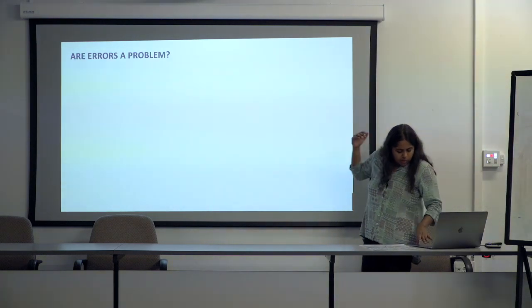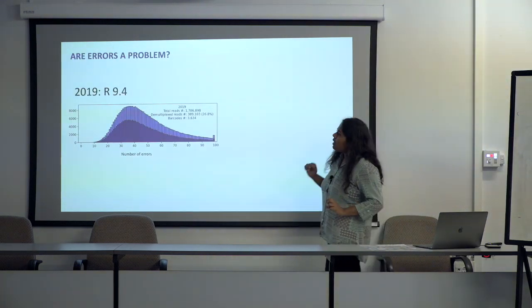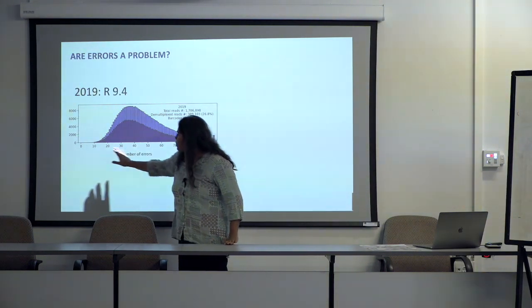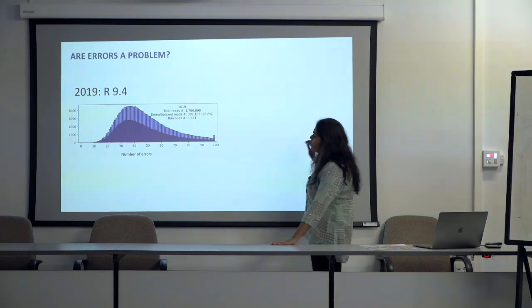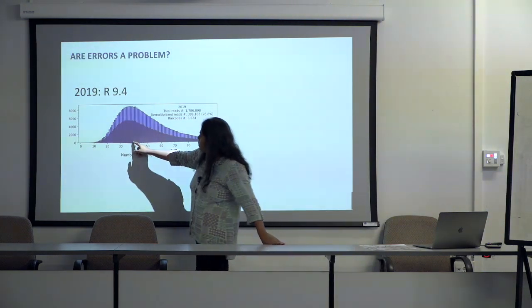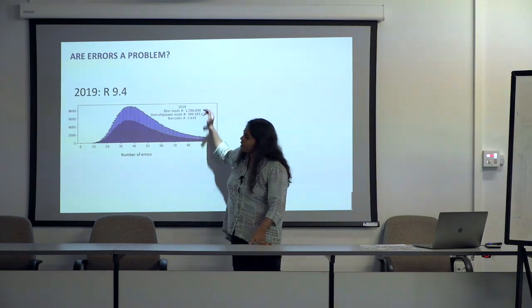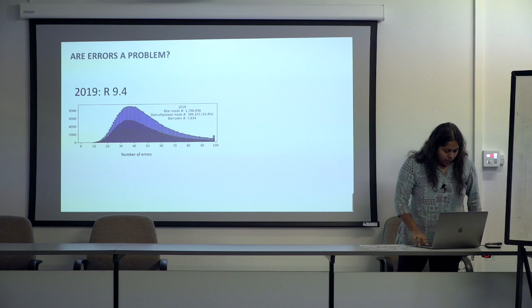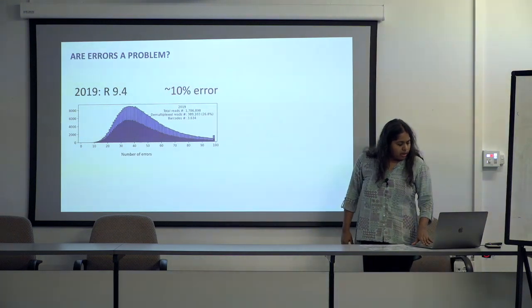Coming back to the older flow cells, this is what the error profile for an older flow cell looks like. This is mapped onto a 418 base pair fragment of CO1. So 40 is essentially 10% errors. This was data we mapped from 2019, raw reads mapped onto reference barcodes.